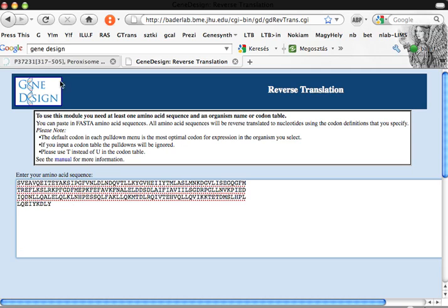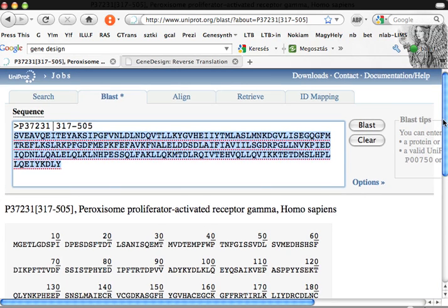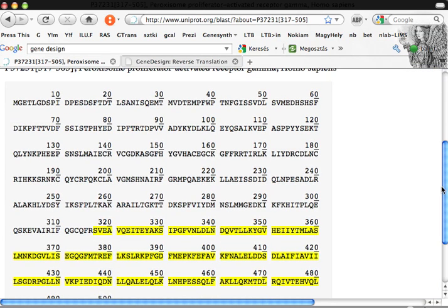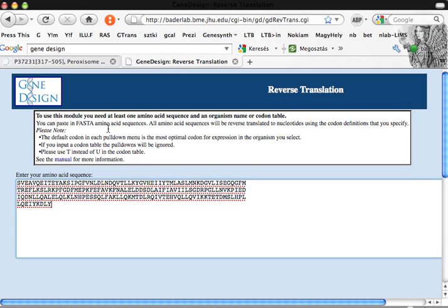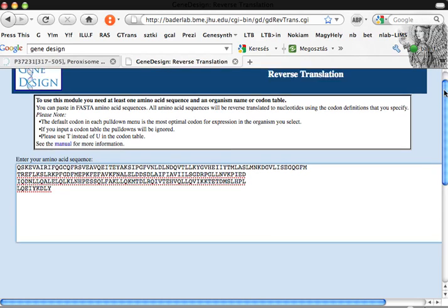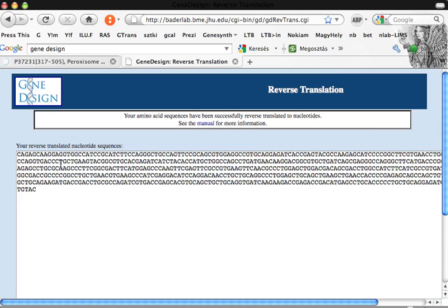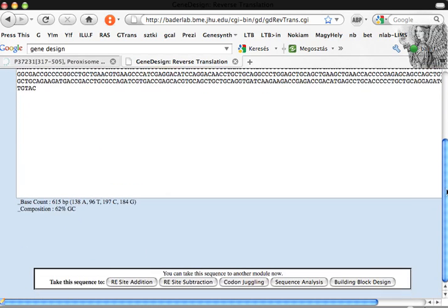Also insert a bit of the hinge region, like this sequence here. We select the organism. The organism is Homo sapiens in this case. If you do it in E. coli, a different table would be used. Press reverse translate. And this is the sequence we generated.